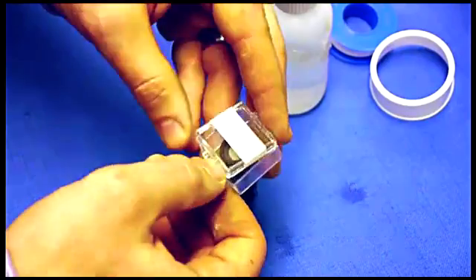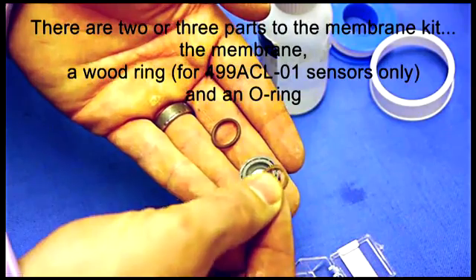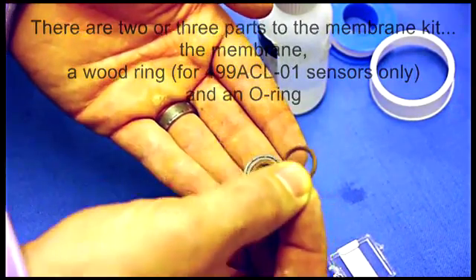Get a membrane kit and open it up. It'll have three distinct parts: the membrane head, a wood ring, and an O-ring.